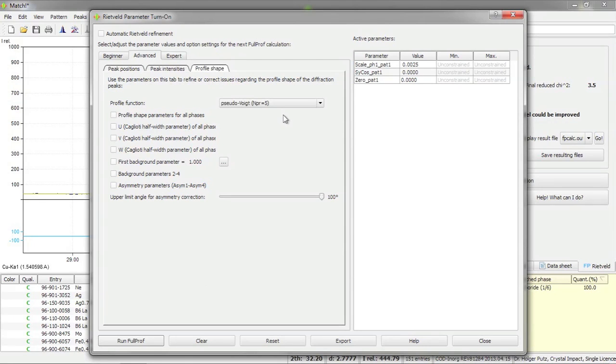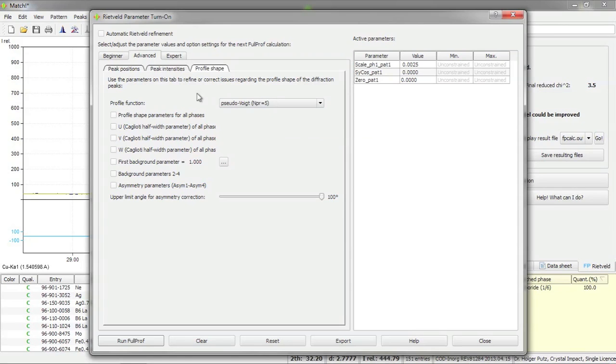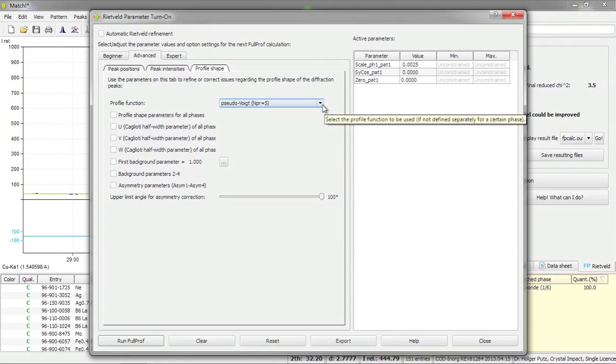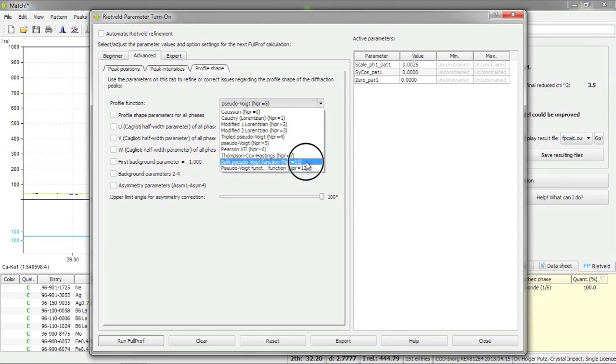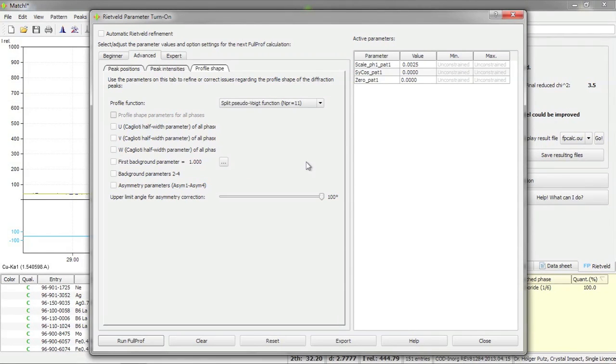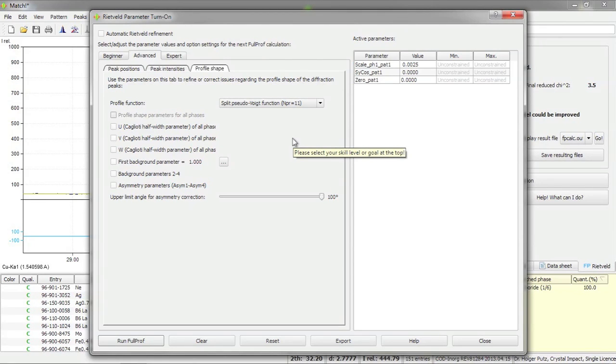And finally, of course most important, the profile shape parameters. As I have already mentioned I would like to get rid of this symmetric pseudo-Voigt function and would like to use an asymmetric function like the split pseudo-Voigt function.